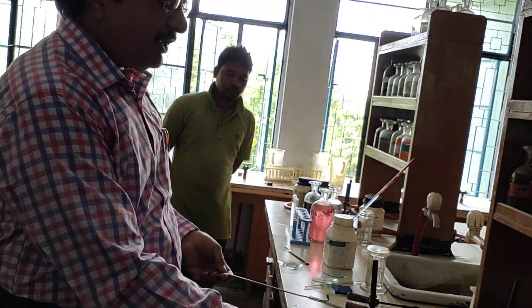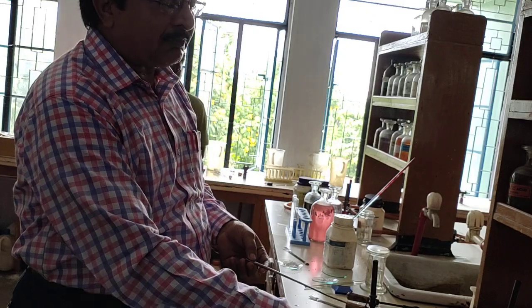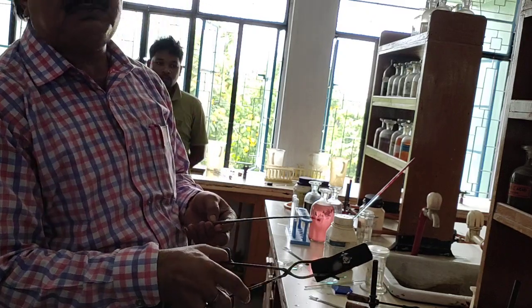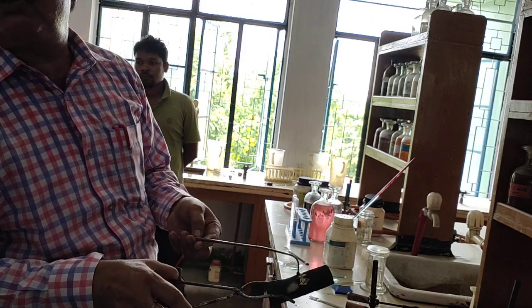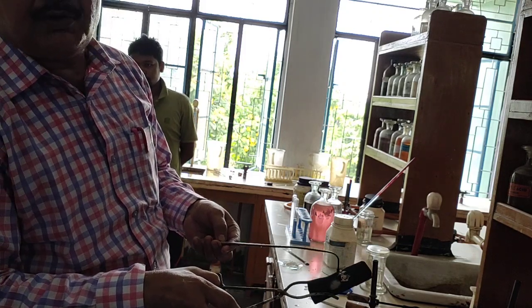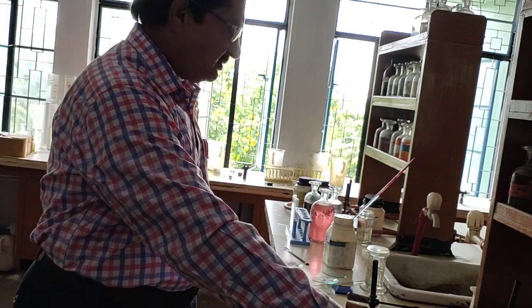So this way we are doing the charcoal cavity test, and in this case we do not perform the cobalt nitrate test because the color of this salt is not going to be white, it is now yellowish. That's why we omitted the cobalt nitrate test.